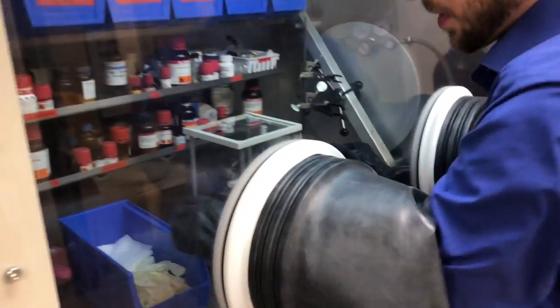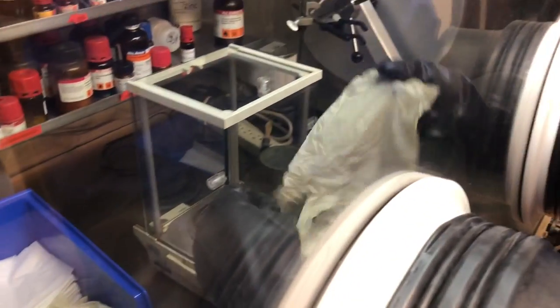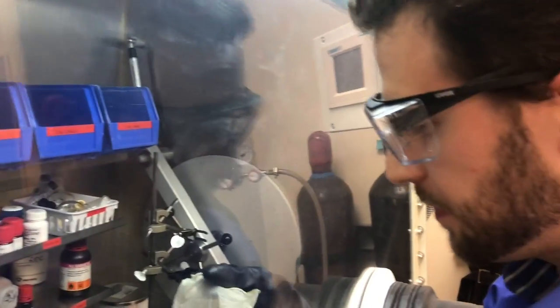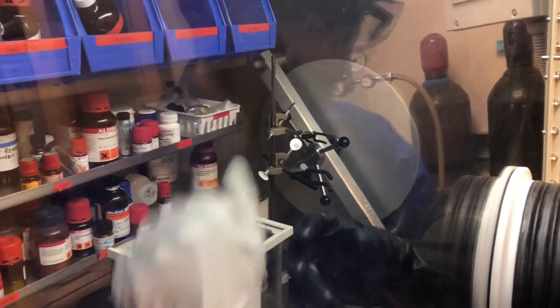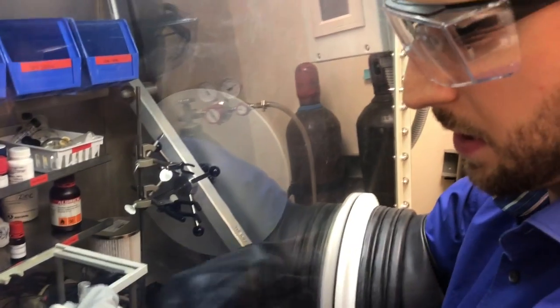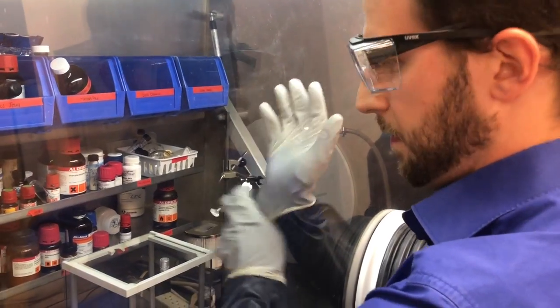Once you're in, we have this blue box over here where we have some dry Kim wipes and fresh white gloves. We put these on to protect the black gloves from chemical spills. Then you're good to go.